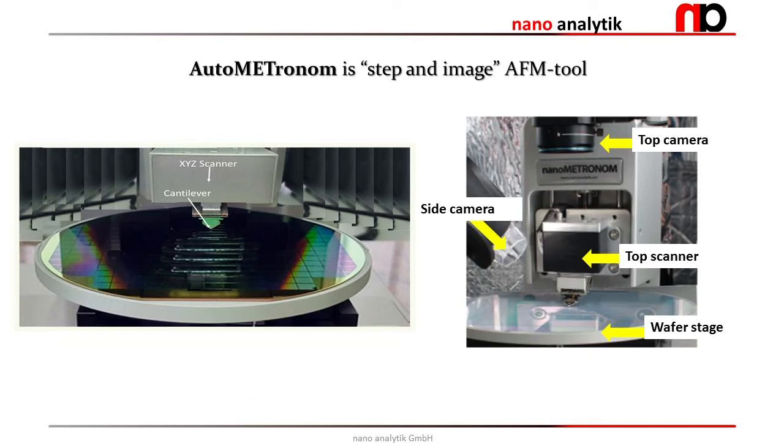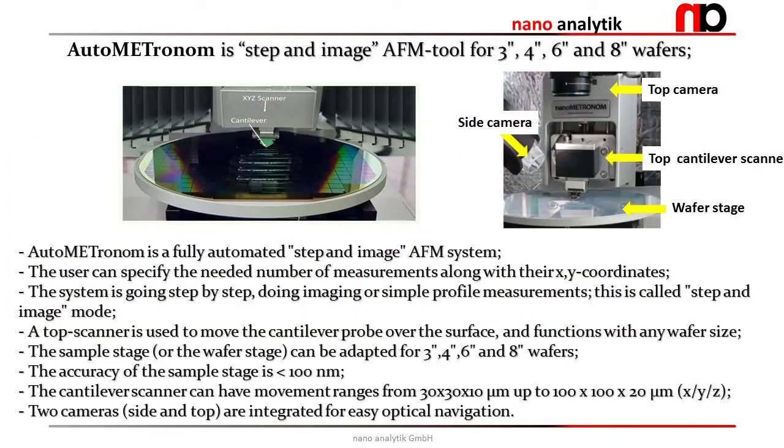On the left, we can see the cantilever positioned above the wafer stage. It's attached to the XYZ scanner. On the right, we can see the top camera, side camera, top scanner, and wafer stage. The AutoMET tool is a fully automated system.